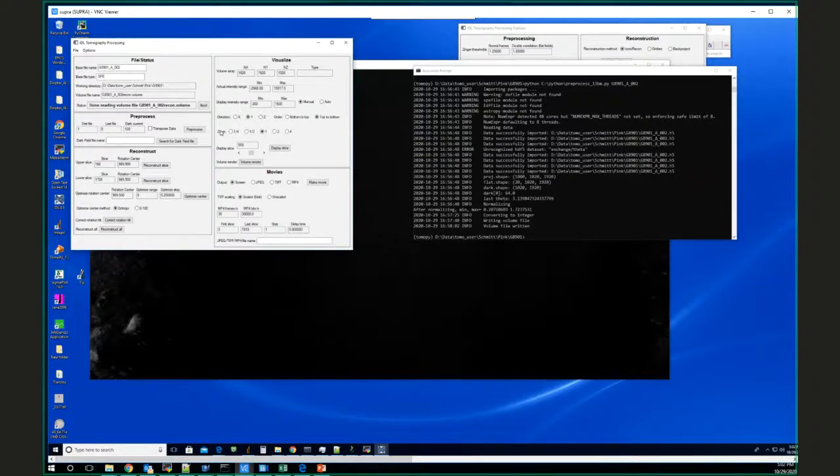So it's good, particularly at a machine like the APS, which has very high energy X-rays, to have the mirror to get rid of them. If we were doing this experiment on a white beam at NSLS2, we wouldn't need the mirror because their beam just drops off in intensity at higher energies very quickly. But ours doesn't. So the mirror is helpful.